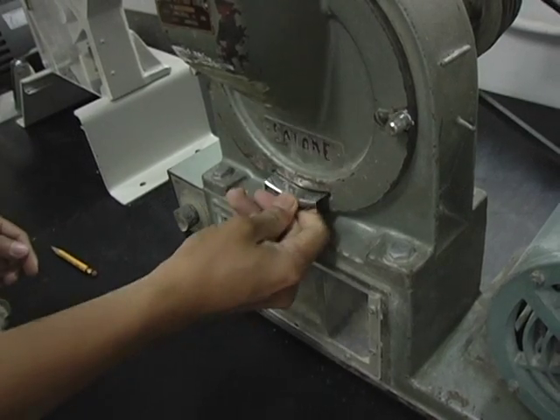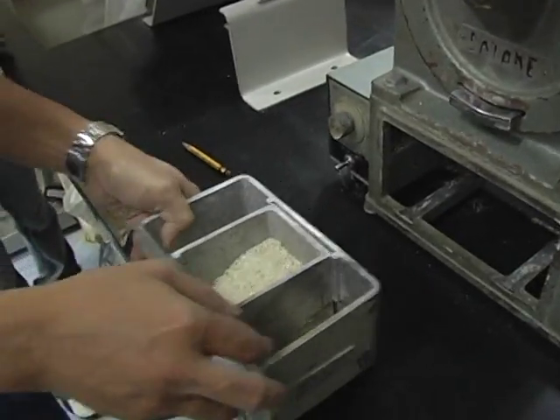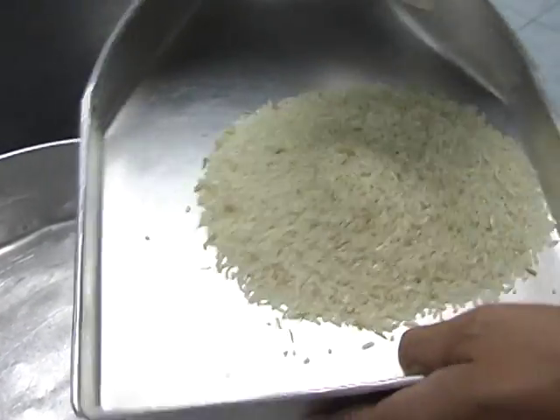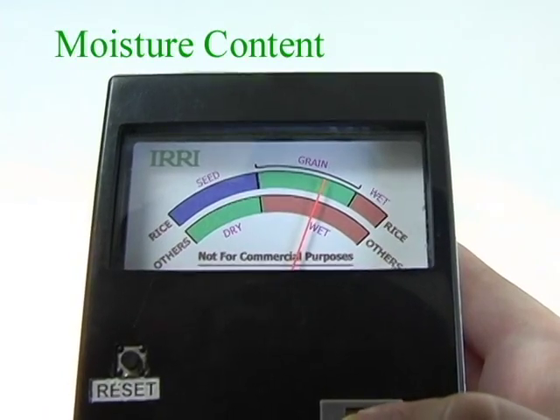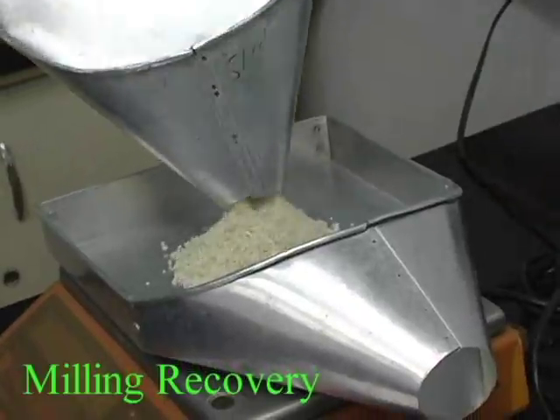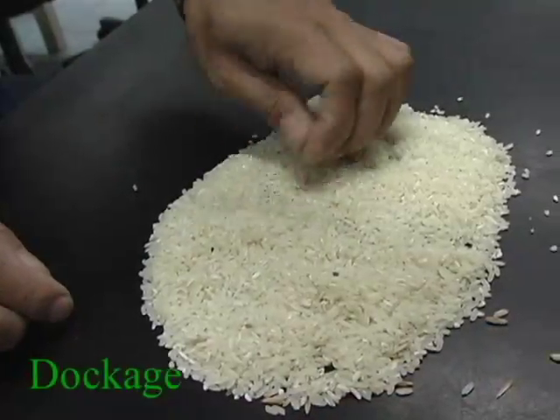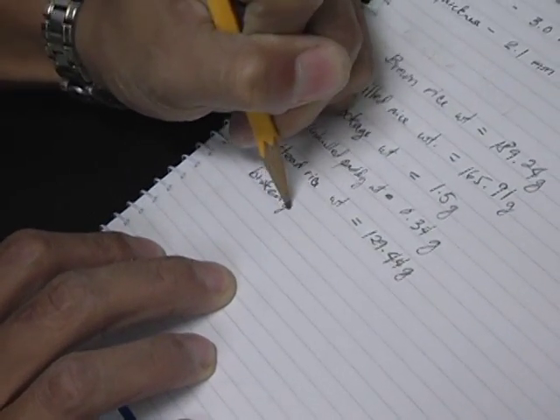There are particular characteristics of milled rice and white rice that are used to quantify white rice quality. The properties of milled rice that should be measured are moisture content, the milling degree, the milling recovery, the dockage, head rice, and broken grains. Let's explore each of these measurements in detail.